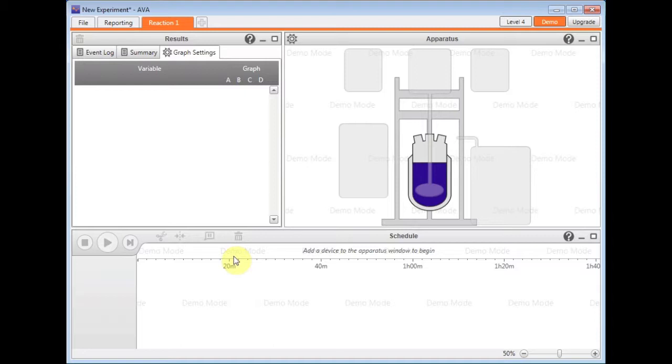I'm in demo mode here, as you can see at the top. This gives me access to all configurations and devices which enables me to evaluate the AVA software without need for either a license or the equipment to be plugged in.